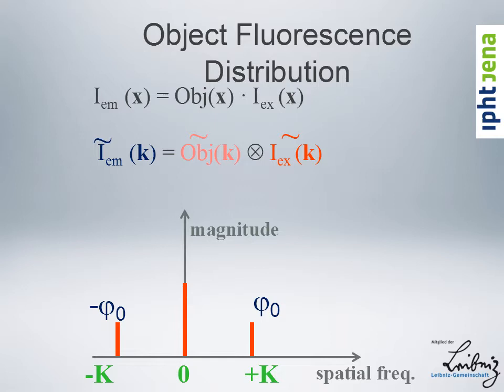And since, like you saw before, it's positive, we have a zero frequency that denominates the constant in the sum of a constant with a sine wave, and the sine wave or cosine wave, whatever you want, is an e to the i kx and e to the minus i kx. So it gives us at plus k and minus k a peak.